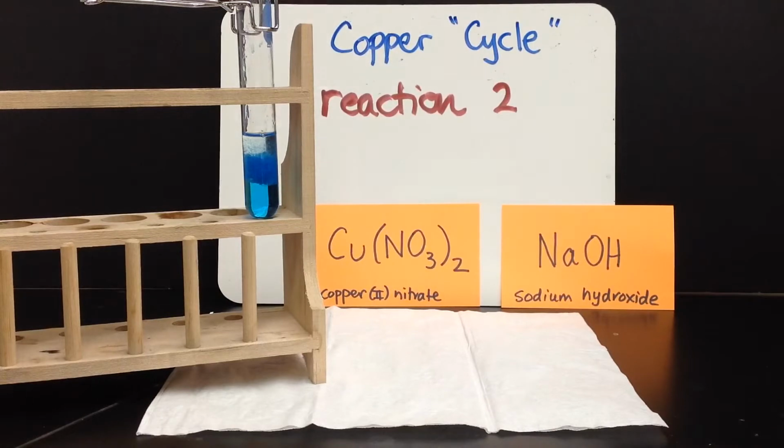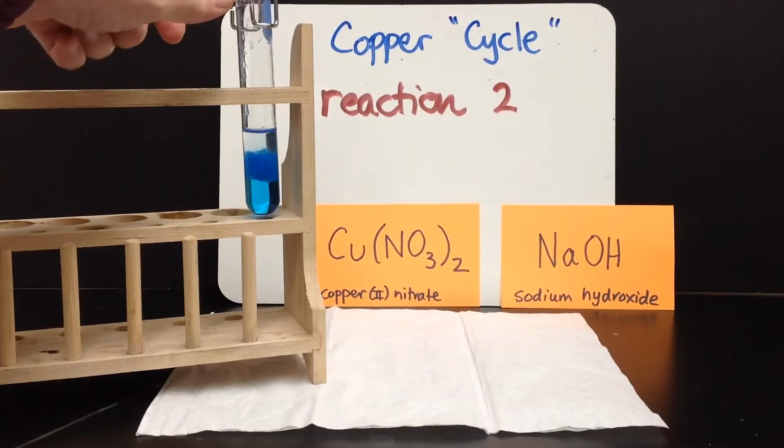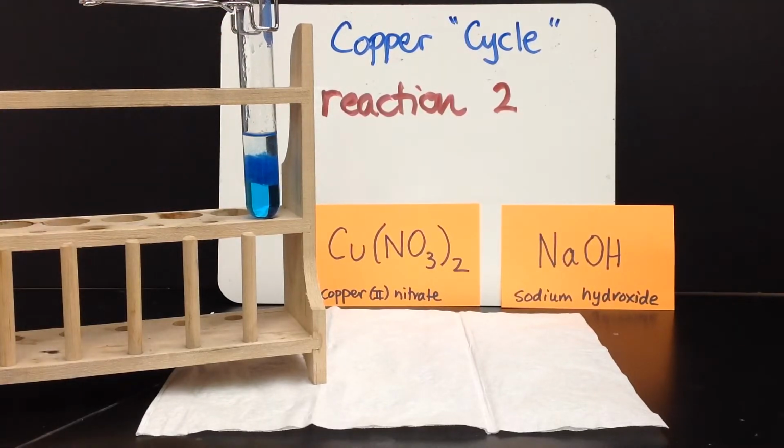Now, the question is, what do we... oh wait, look at that. On top here we have this colorless liquid, and at the bottom we've got that blue liquid, and at the interface where the two of them have come into contact, they've had an opportunity to do something a bit more interesting, and we have some sort of blue glop forming right here.